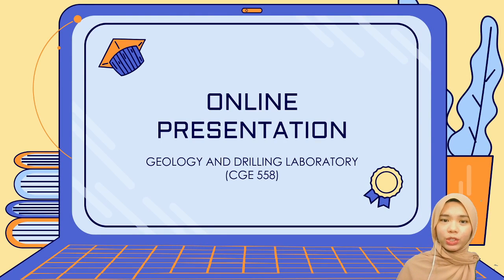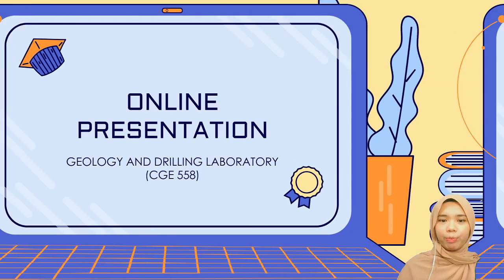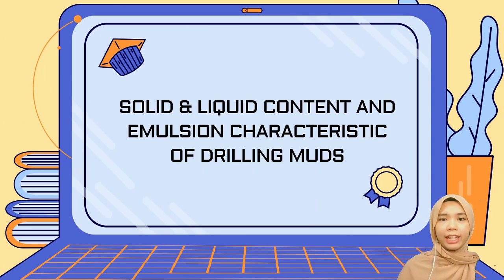Today, for our presentation of Geology and Drilling Laboratory, we'll present our Lab 3 experiment, which is solid and liquid content and emulsion characteristic of drilling mud.